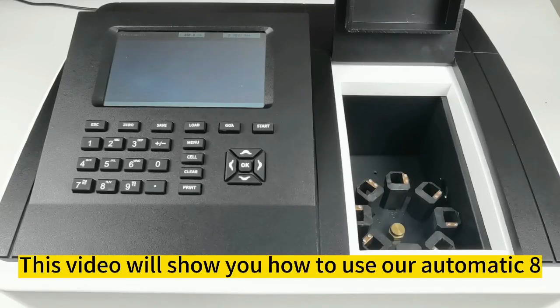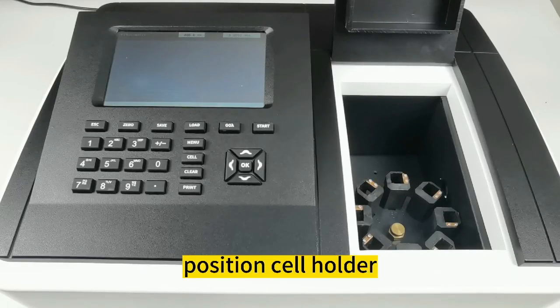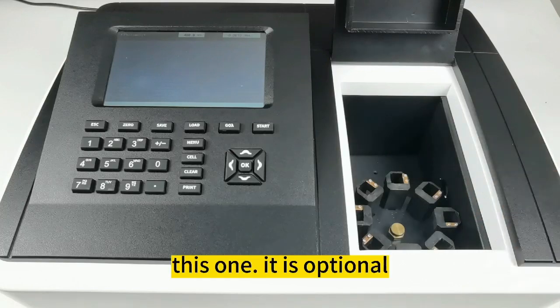This video will show you how to use our automatic 8-position cell holder. It is optional.